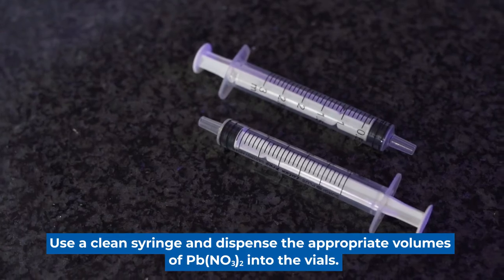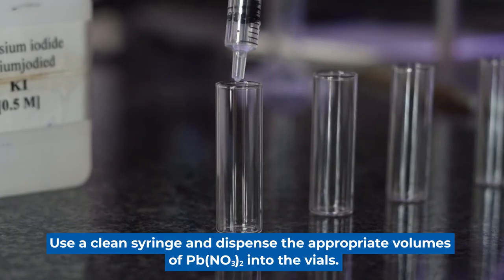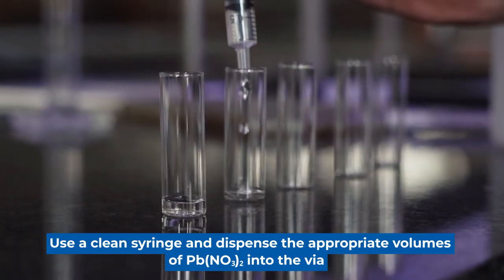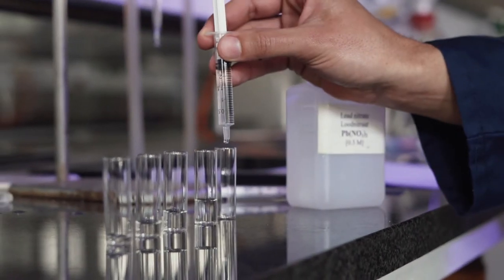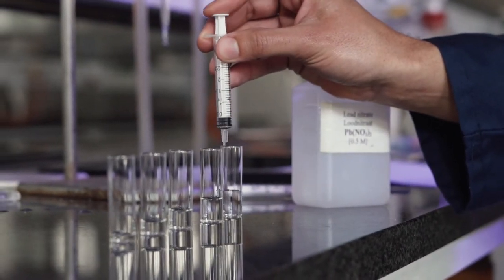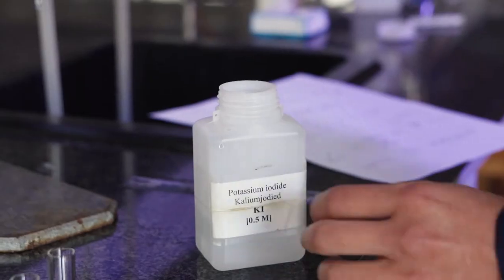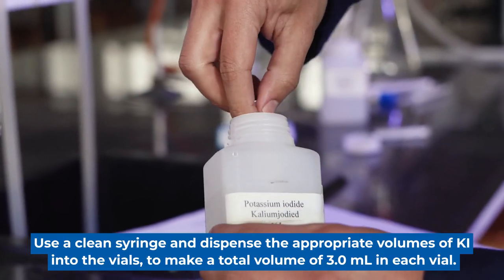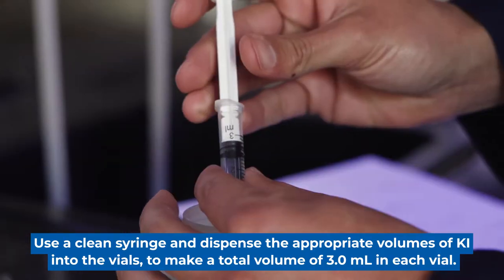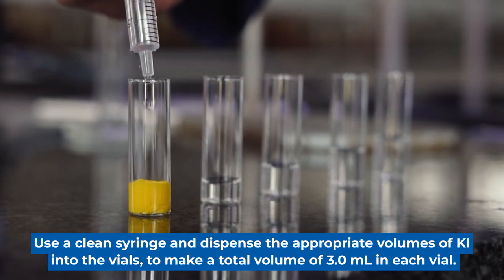Add the appropriate volumes of lead nitrate into the vials using a clean syringe. Using a clean syringe, we will now add the appropriate volumes of potassium iodide to each vial to make up a total volume of three cubic centimeters.